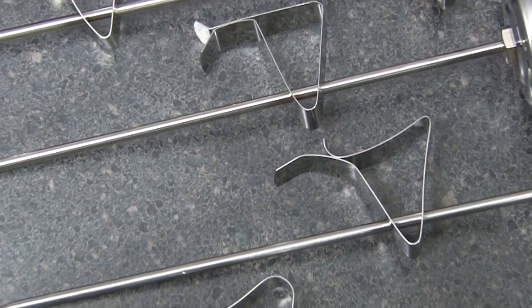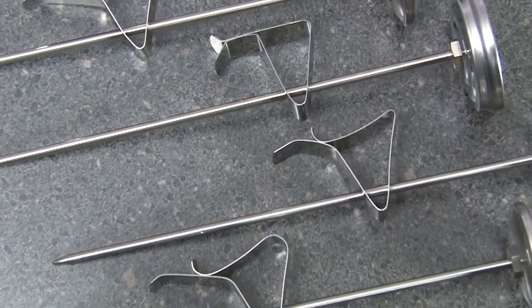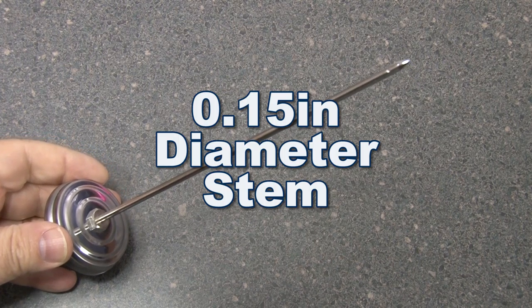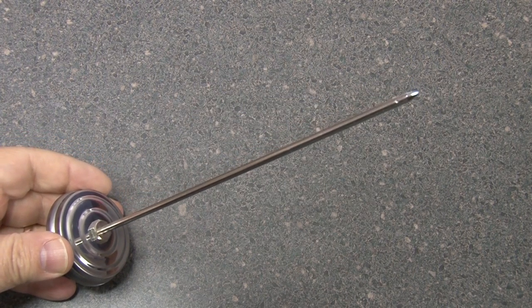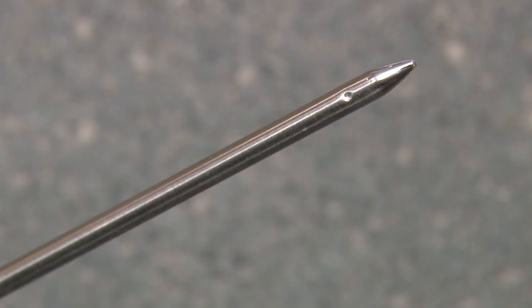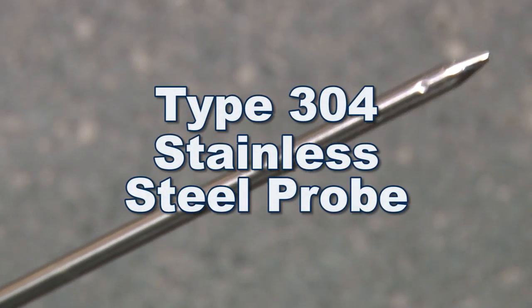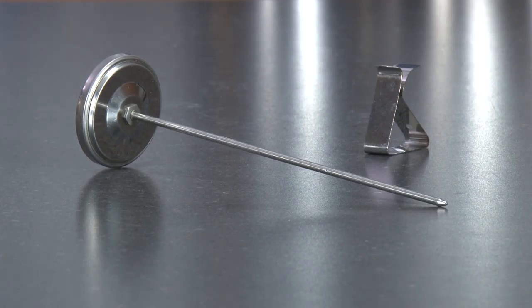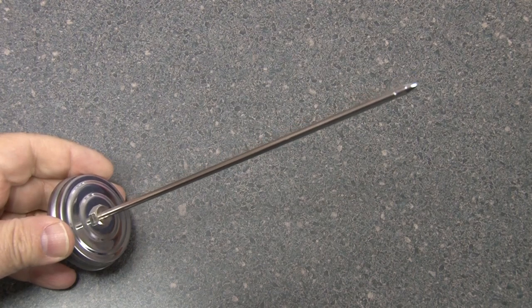The Gilson MA121 through MA124 thermometers have a 0.15 inch diameter, 8 inch long stem made of type 304 stainless steel. The stainless steel probe is resistant to most laboratory chemicals and is easy to clean.